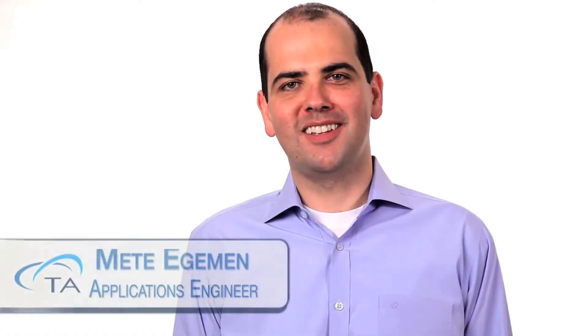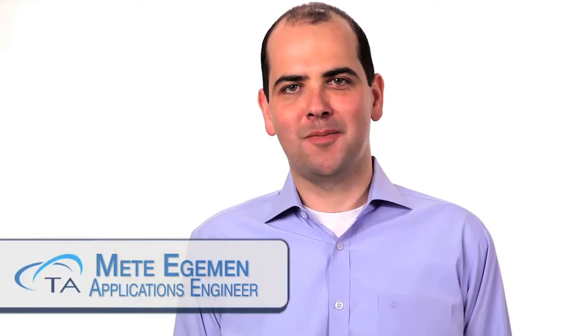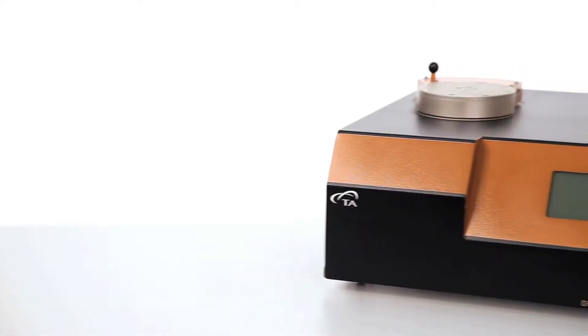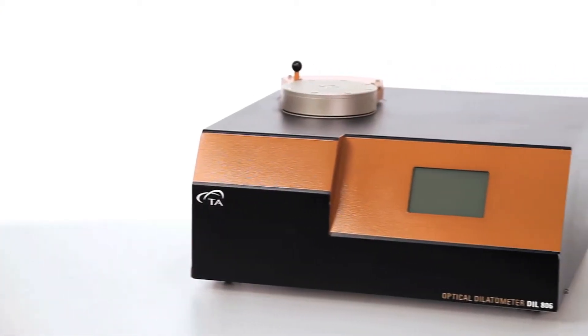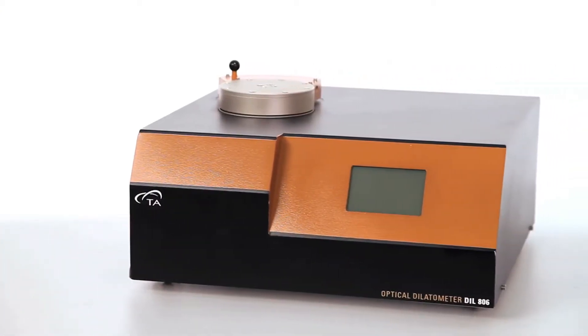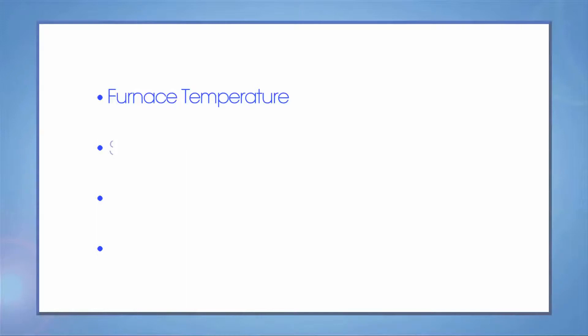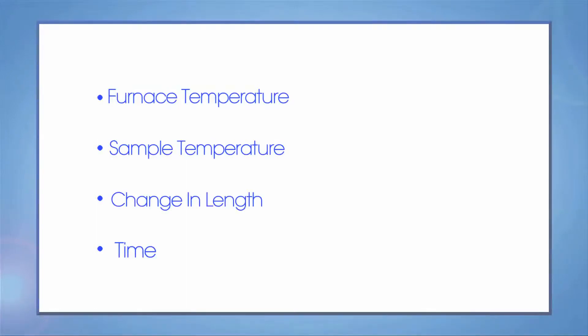Hello, welcome to another TA Tech Tip. In this Tech Tip, we will discuss the post analysis options for WinTA software for dilatometers. All TA dilatometers measure four variables: furnace temperature, sample temperature, change in length, and time. Everything else is calculated using these four variables.